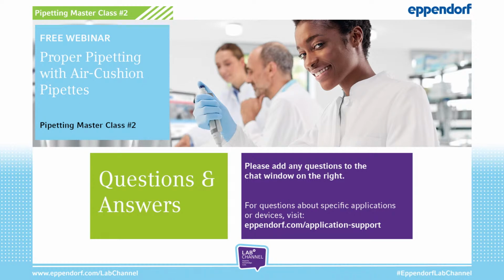Thank you. The next question I would like to ask you is, you explained forward and reverse pipetting with a standard 2-button pipette, but what about 1-button pipettes? Probably they use a reference pipette. Which one is better, 1-button or 2-button pipettes?